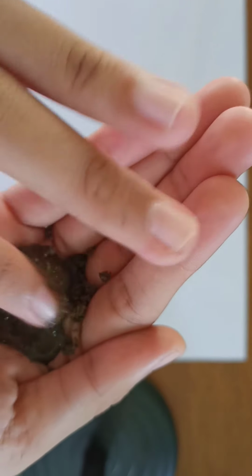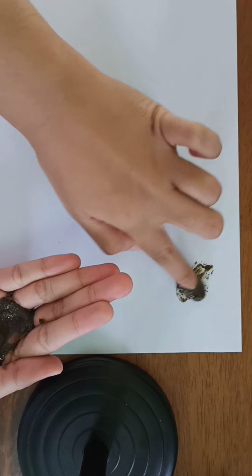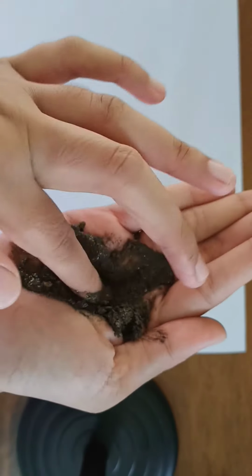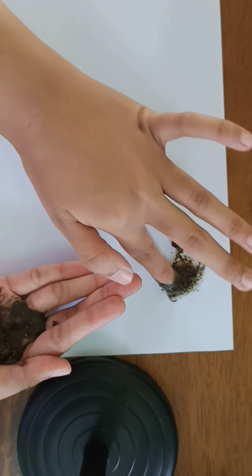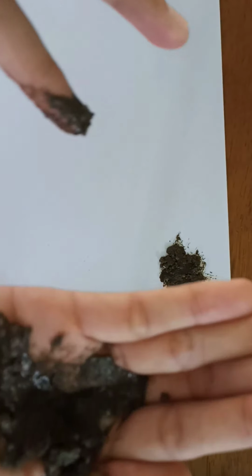Okay, and add a little water to make a paste, and then you try to make a little paste and smear a small amount on a piece of paper. Okay, this is for sample 1.